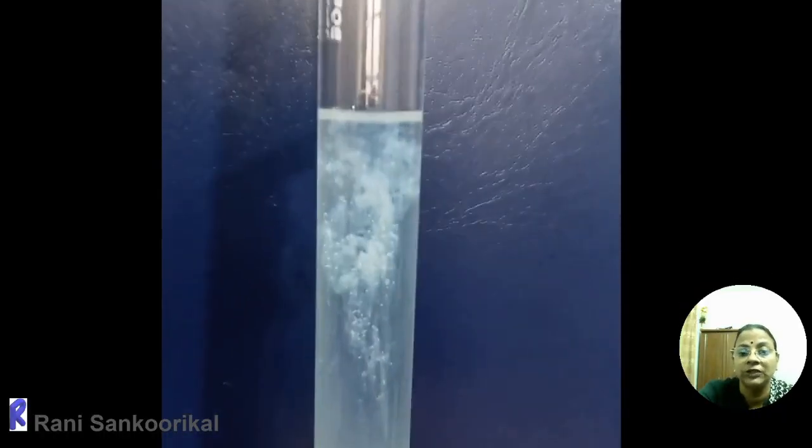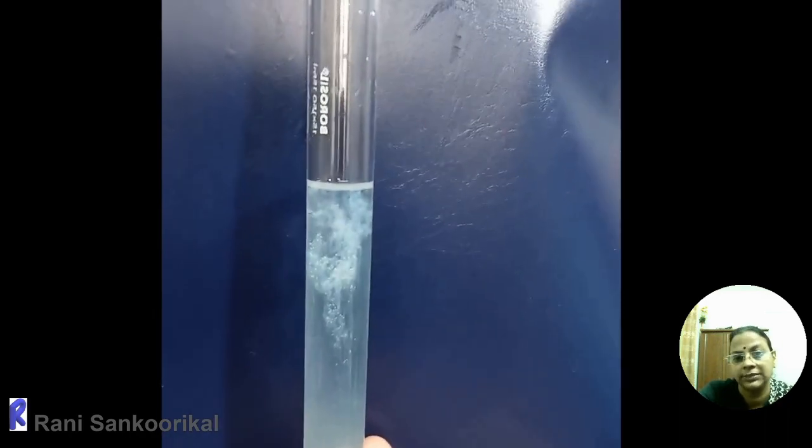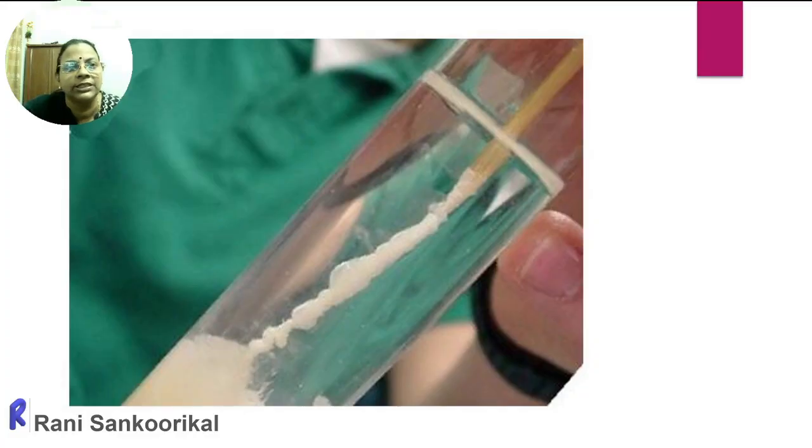Now you can observe the strands of DNA. Once the strands are separated clearly like this, a very clear strandy appearance will be there. That is the DNA strands. Now you can see the DNA strands. By the spooling technique, we can extract the DNA strands in this way.